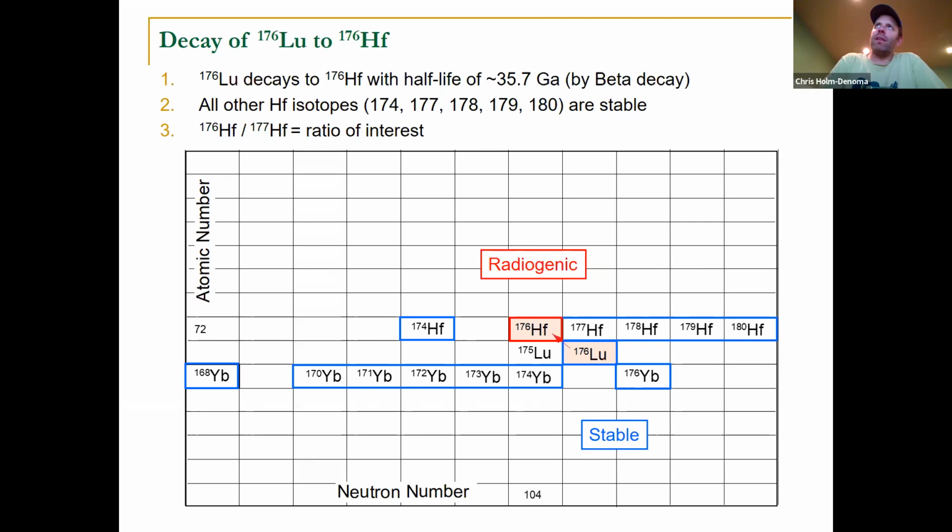How much of an impact does 1200 analyses have versus 120 when you're comparing different samples to each other? Yeah, I think it's always data dependent, sample dependent, right? That's why for all the routines that we can do, these rapid analyses, live reduction is kind of the next step. If you're analyzing and not learning anything new about that sample, then stop it at 100, stop it at 300. Because you don't need 1200 or 1000 for every sample. If it's super complex, you might.